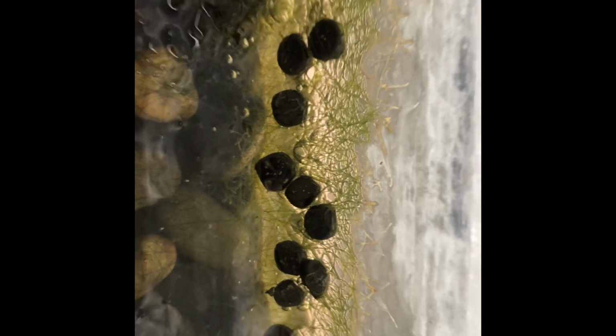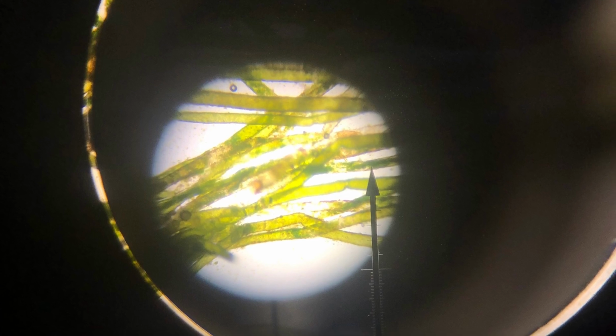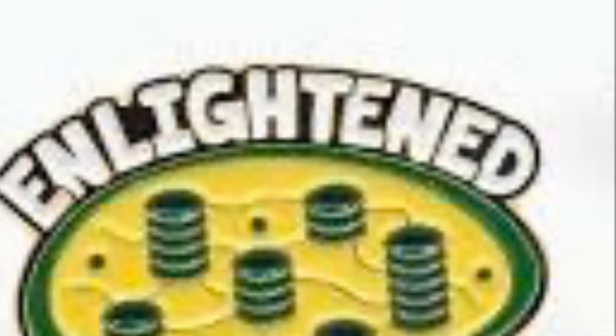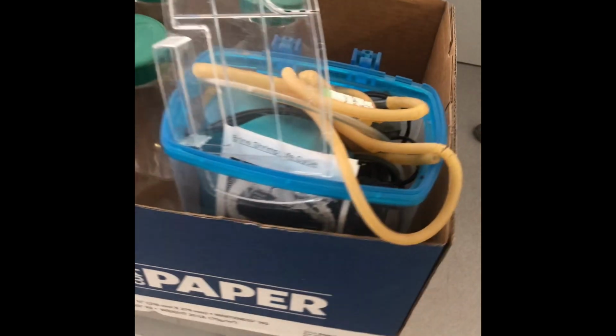Should we look at these under the microscope? Let's do it. And here's what it looks like, all nice and green. Do you remember what that color comes from? Which organelle houses the pigment chlorophyll? That's right, it's the chloroplast. Now you're enlightened. So on our investigation, I actually stumbled upon this.